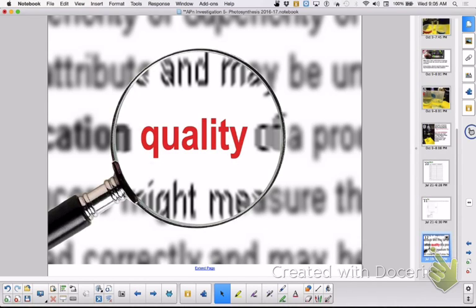Okay, questions or concerns on the lab? Yes? What is the cleanup first? Okay, so the cleanup for the lab is you're going to call me over, you're going to show me your data, because I'm going to sign off on your rubric that I saw your data, and then I was good with it. And you're going to show me your nice, well put together bucket, and then I'll give you the sign off, and then you'll put the bucket back up here, and your lab station will look like it did before.